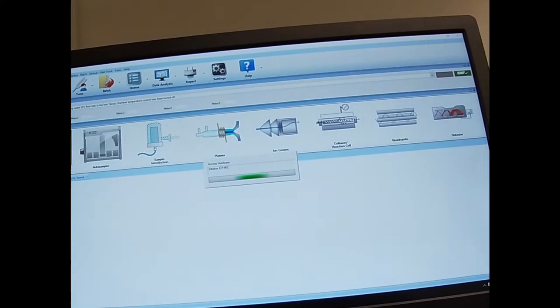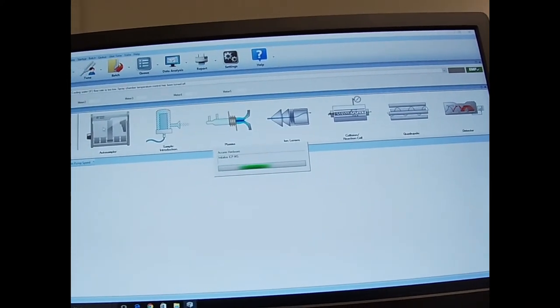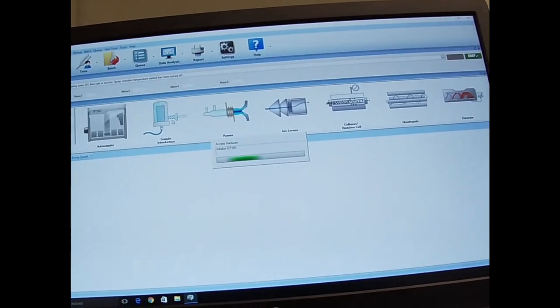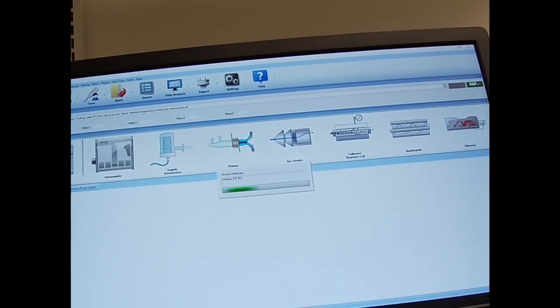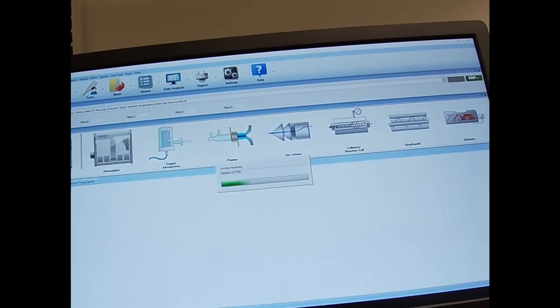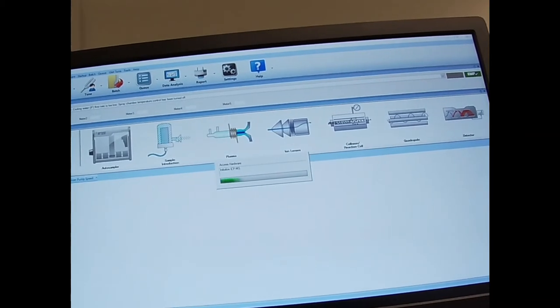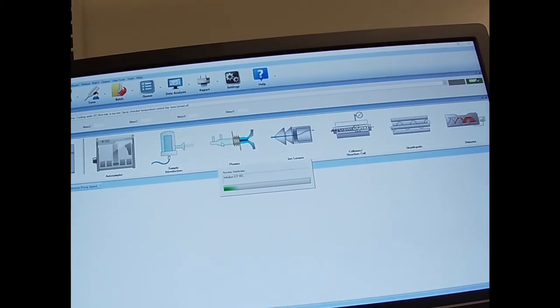So we're initializing and you can see here we have our mainframe. This is the auto sampler. This is essentially representing our nebulizer. So we have our sample come in, it gets vaporized. Large droplets drain and of course the smallest ones actually enter the torch.